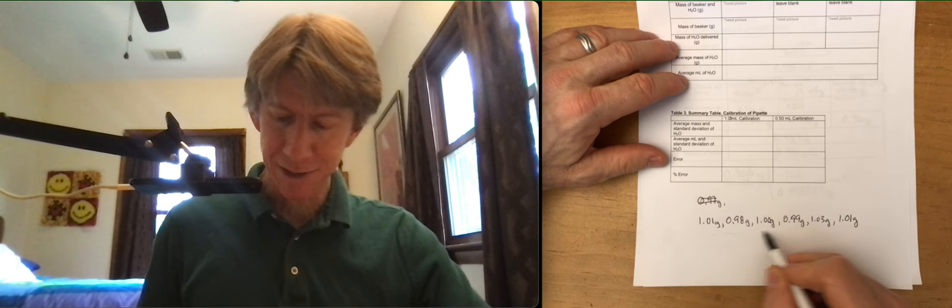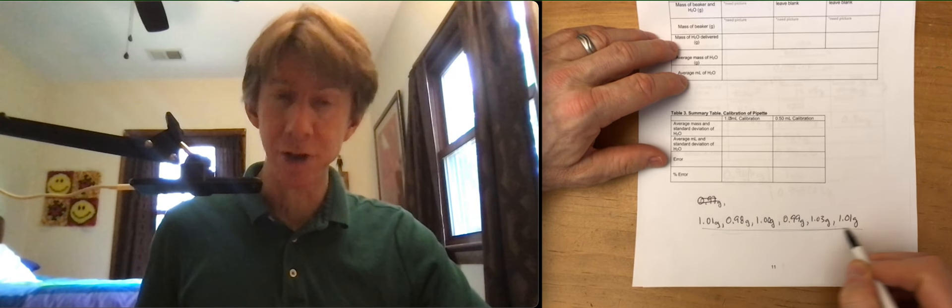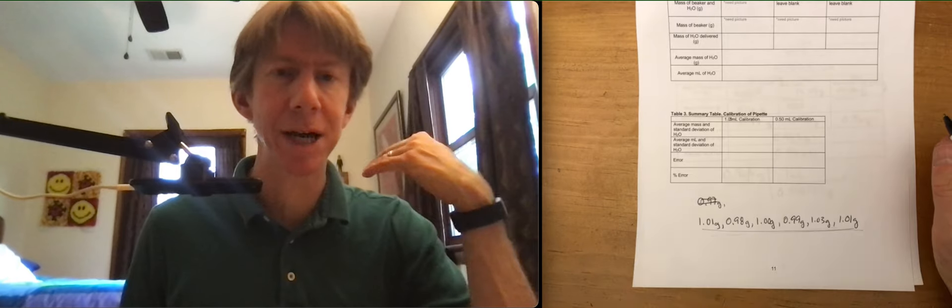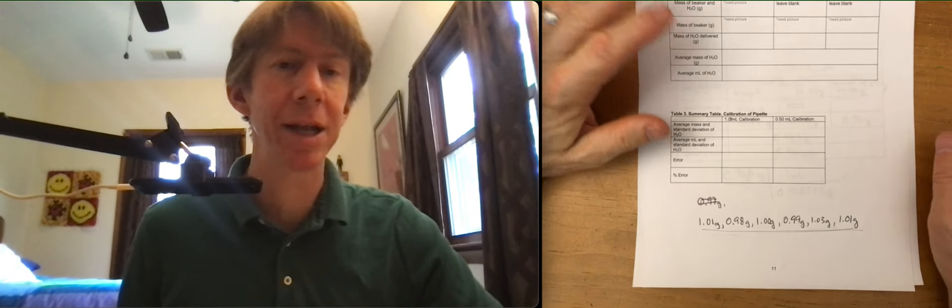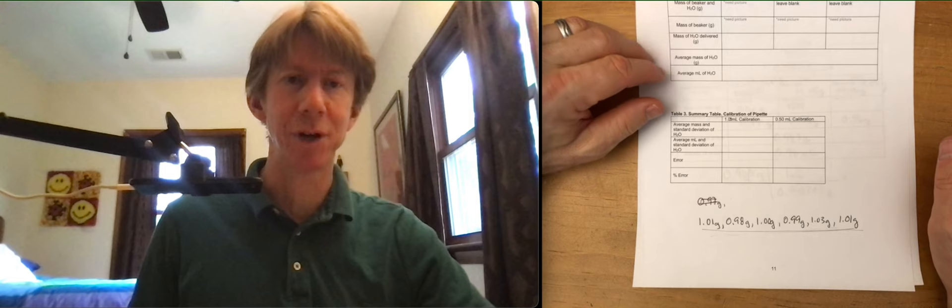I have my six values, my six good values. I'm ignoring my three values that led to the 0.96 that was too far off.